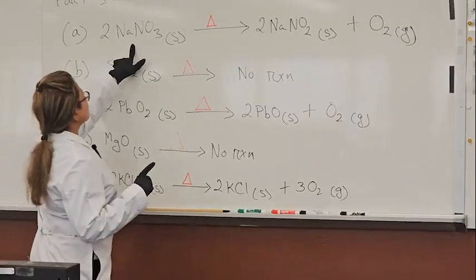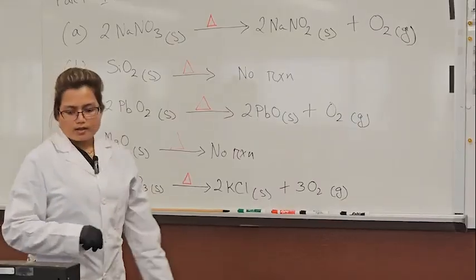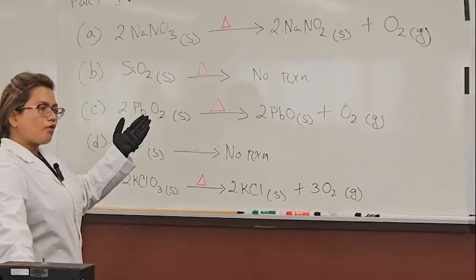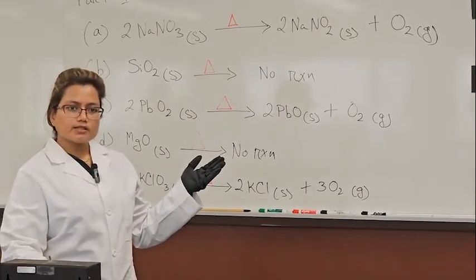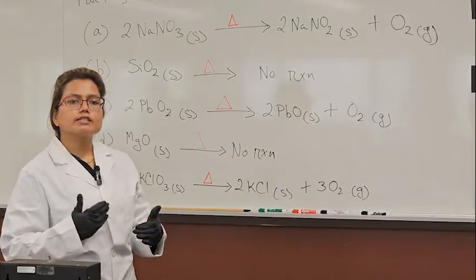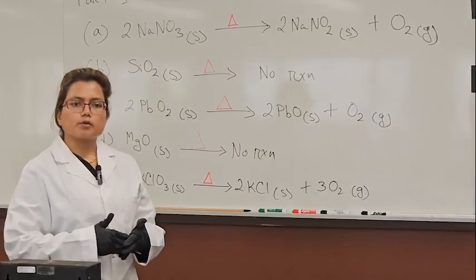One more thing: these are complex compounds and we are heating them, which means this reaction is a decomposition reaction. Also, before heating we will see some physical properties, such as the state of matter, and after heating we will see a different state of matter. Maybe it melts, maybe the color changes. All of these are related to physical properties.